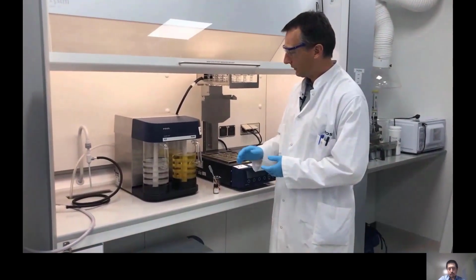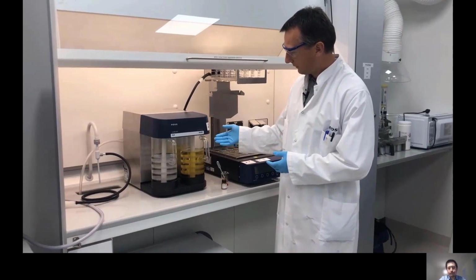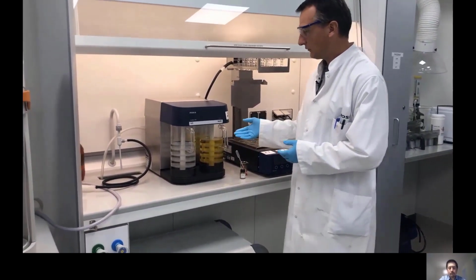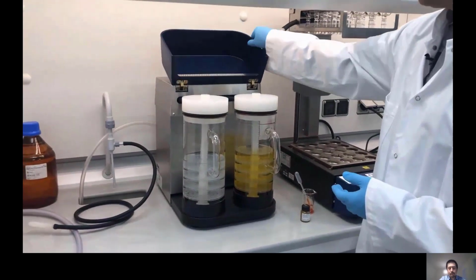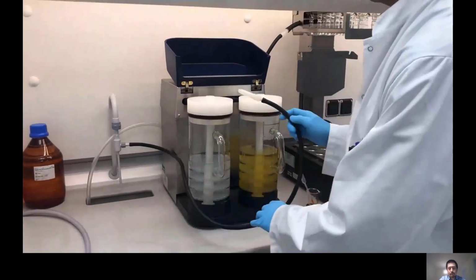So this is how it looks when the alkaline has become acidic and the indicator has changed to a yellow color. And now it's time for emptying the waste and exchanging the fluid. You can do this by using this water aspiration pump here.